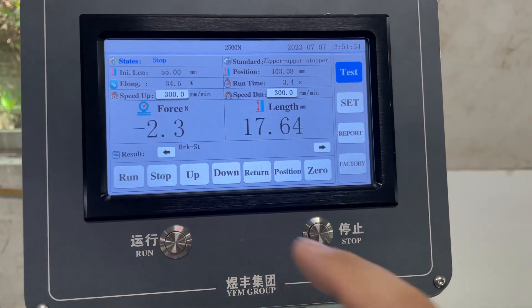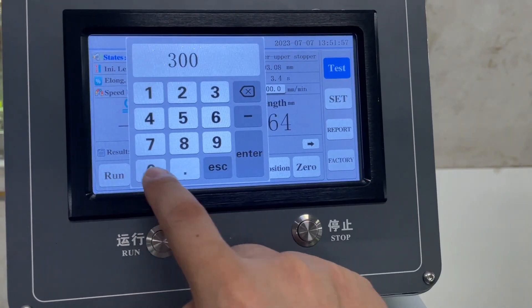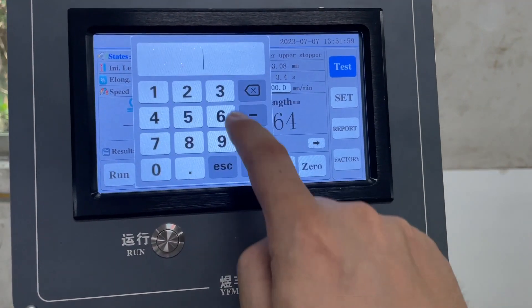We need to set up the speed. Speed up, we set to 300. Speed down, we also set to 300.